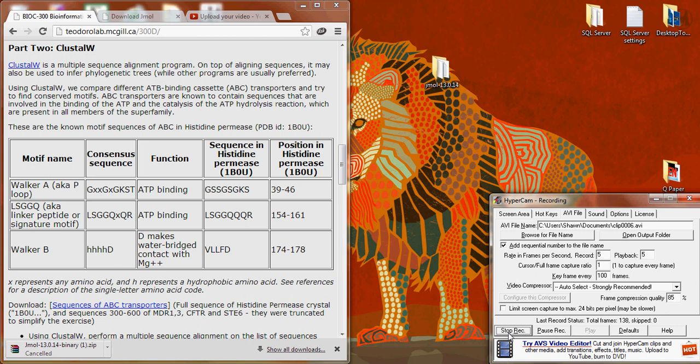Hi everyone, so if you're having trouble using JMol for the last part of the Bioinformatics Lab, then instead of going on the PDB website to use the JMol app they have there, which is highly reduced in functionality, you can download JMol itself.